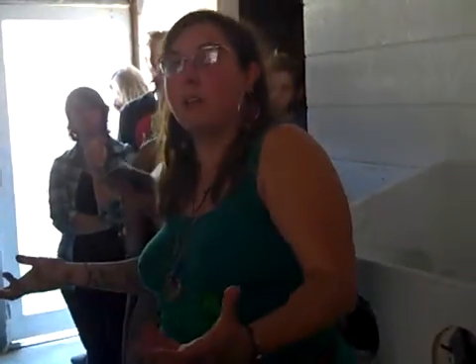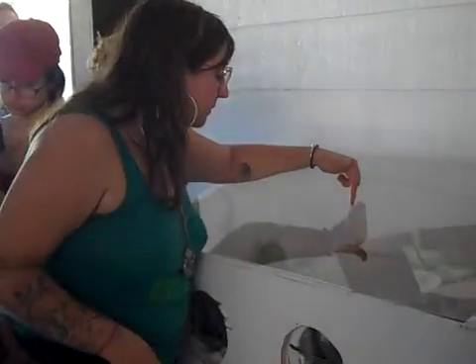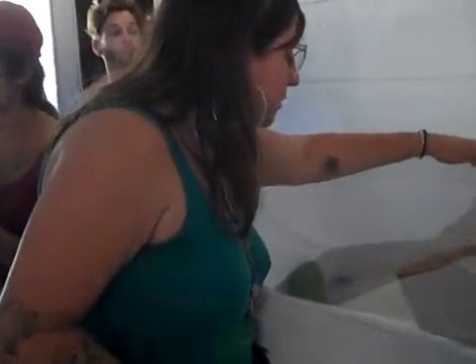And really that mushroom is just mycelium, just specialized, right? The way I like to think about mycelium is like a stem cell that can be a sclerotia, it can be the fruiting body, it can do whatever. So we take that tissue and put it on a petri dish, and that tissue will be mycelium again. It'll start running. If you want to look, I'll move away. Here are some plates, and it may not be super present, but there's some mycelium growing on it.